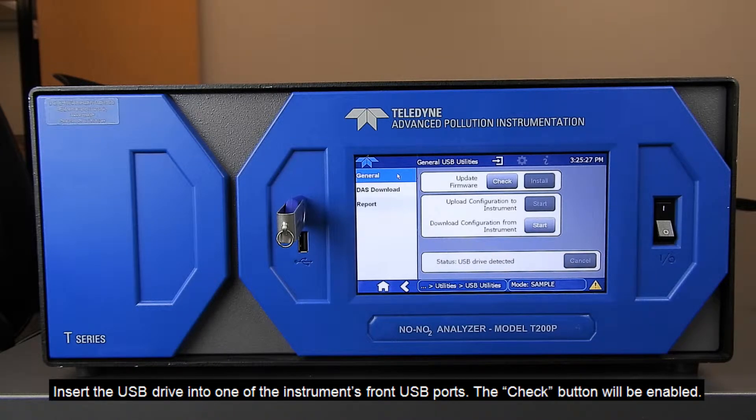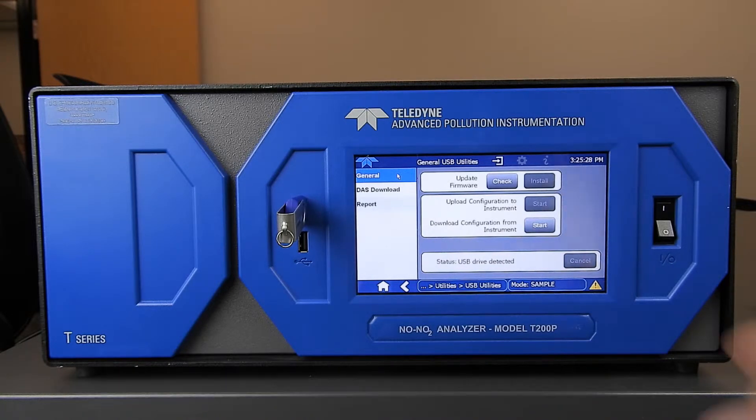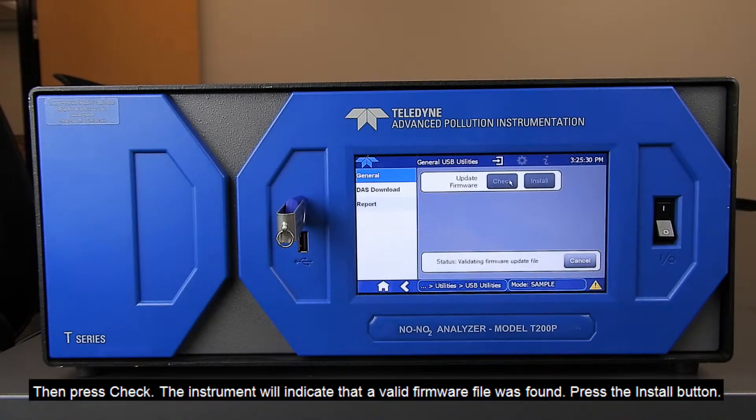The Check button will be enabled. Press Check. The instrument will indicate that a valid firmware file was found.